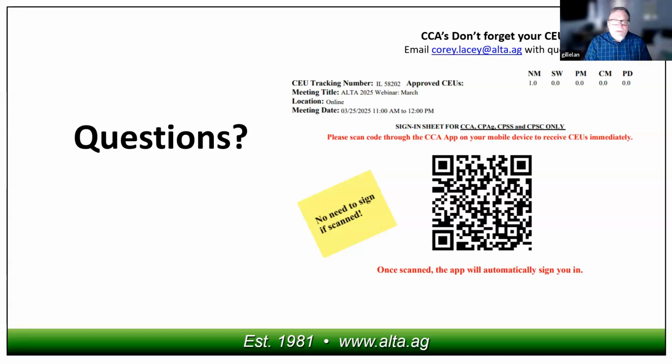And I'm kind of jumping around, but I get all excited about these problems and I want to shotgun them and just jump in and start fiddling around with things. No, I love the energy, Greg, and I think you're highlighting that maybe there's a whole other webinar just on ICP sample introduction systems and these kinds of considerations.